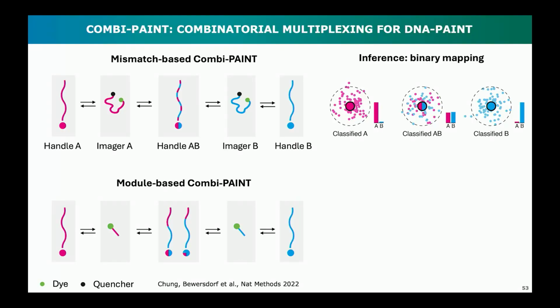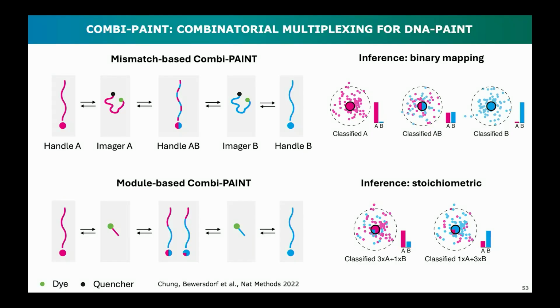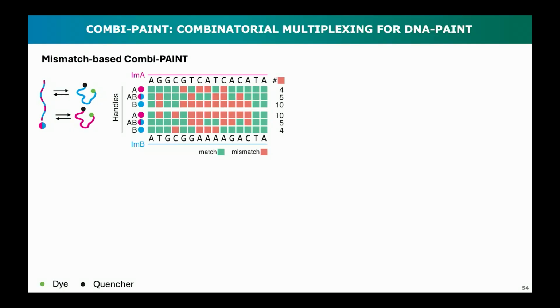But not only that, another alternative to do this is to generate concatenations of strands that have different stoichiometries of binding to the different imagers. And in that case, it is possible then to have in-between stoichiometries, and then with 2 imagers maybe have 5 targets. You can go even beyond the exponential scaling. So that sounded very appealing, but we had to do it, right?